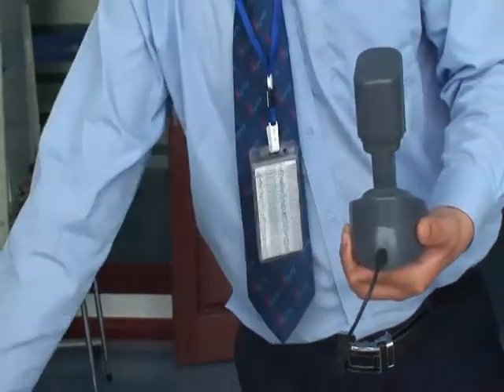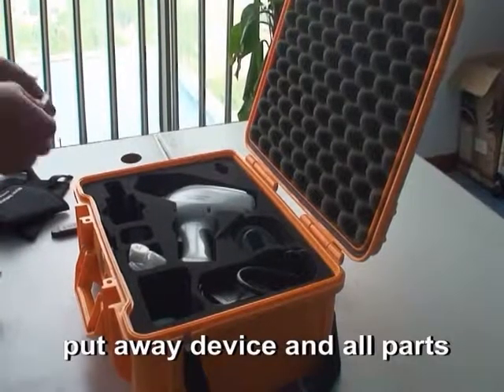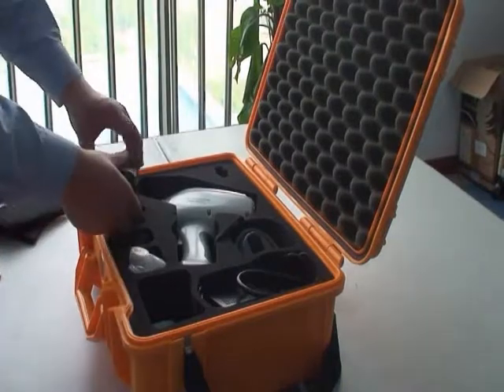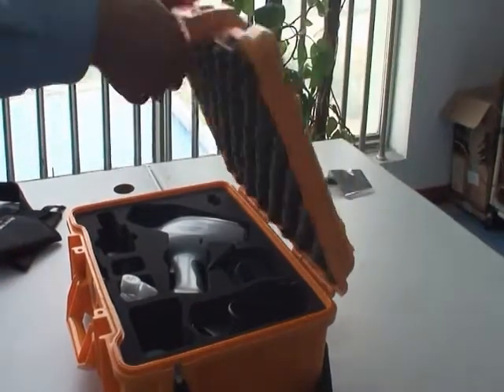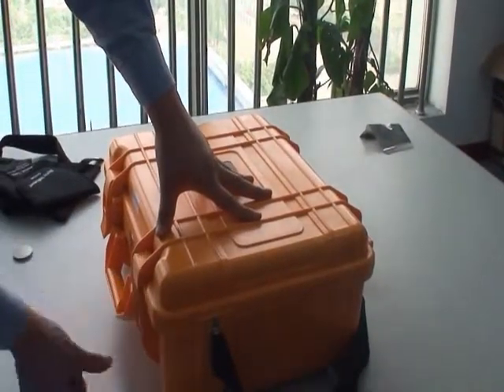After the test, put all parts in their corresponding places and lock the suitcase. That's the end of our demonstration.